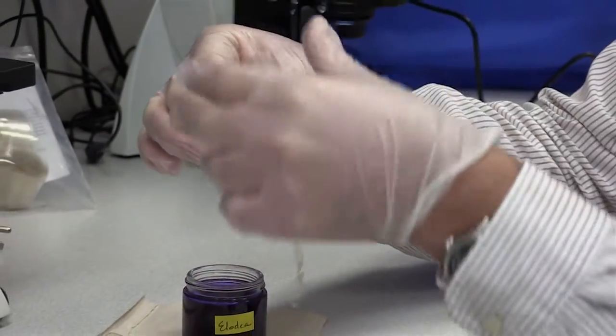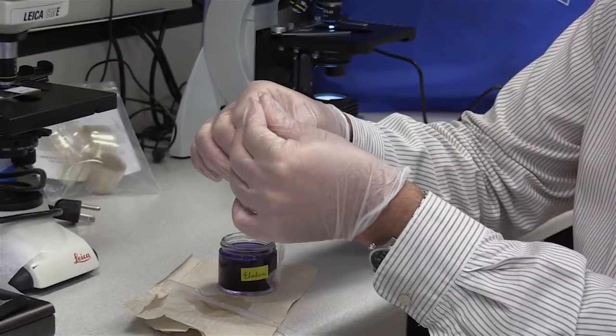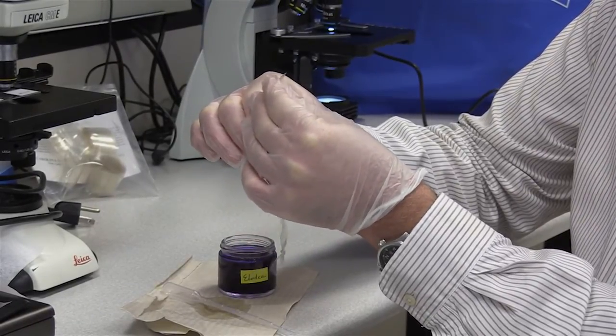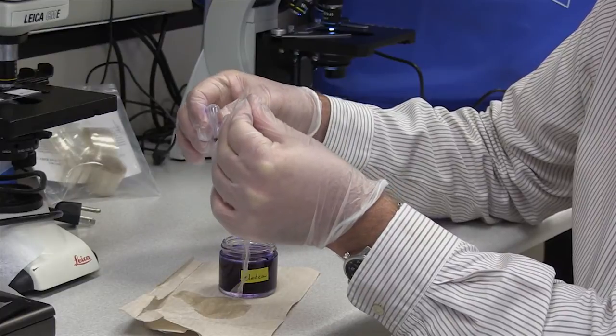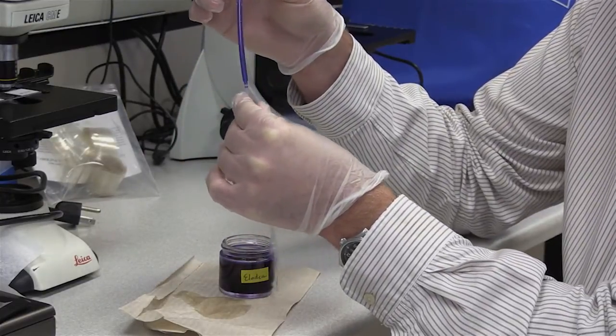Now, when you're making cells for your osmosis lab, you're going to be putting different types of sucrose solution inside of your cell. But I'm going to just use some water that I've added a little bit of dye to so you can see what's happening in the cell.